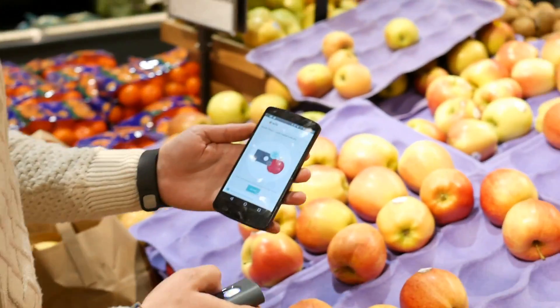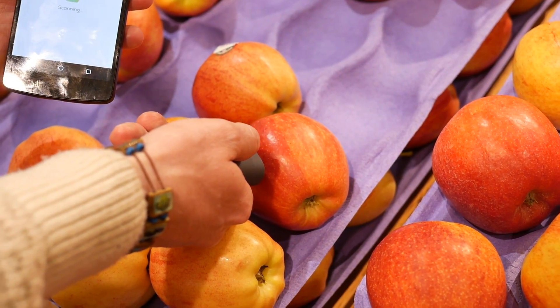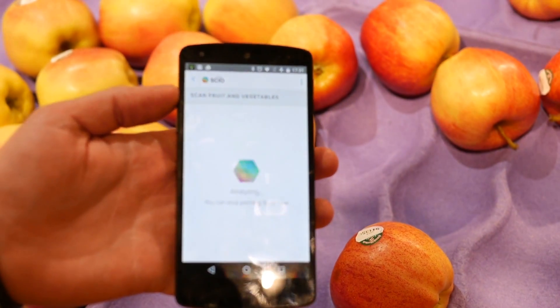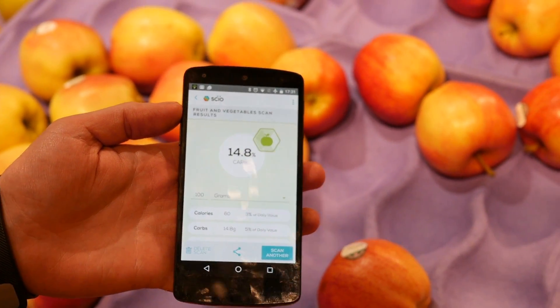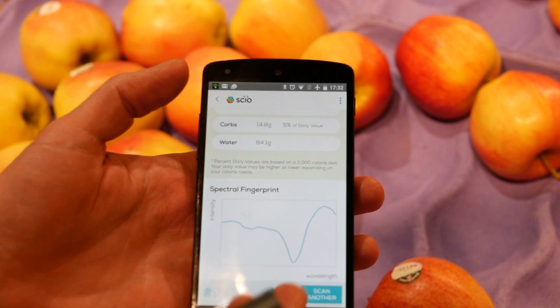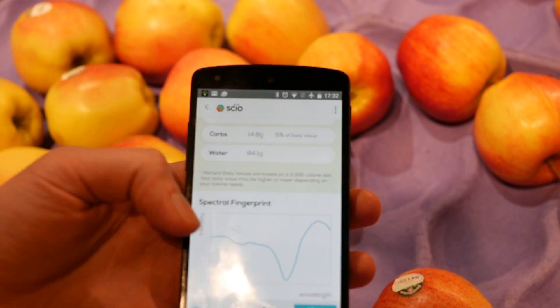We can go and try something different. You can try another apple. This is a Royal Gala — going to come up to there, a little press — talking to my phone, the application right now. And again, this one's got a little bit higher in sugar and it just gives you some really cool information. And again, like the spectral fingerprint of each apple, the molecular composition of it is going to be different in everything.